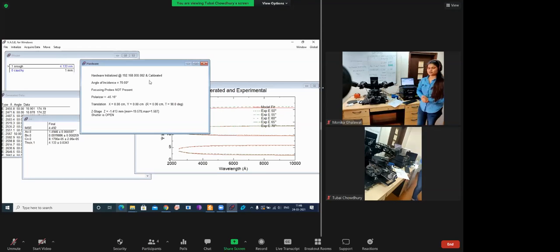Thank you so much. We are not working on thin films, so we need your information. We are using mica sheets. Okay, mica sheets. We use zinc sheets and normal glass slides. Okay, thank you so much for your information. We'll use it in further workshops. Any other kind?